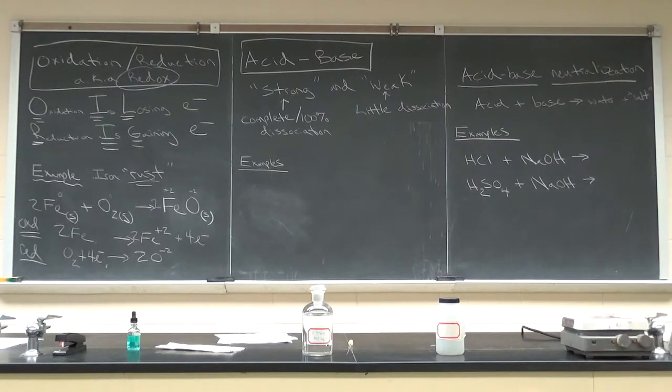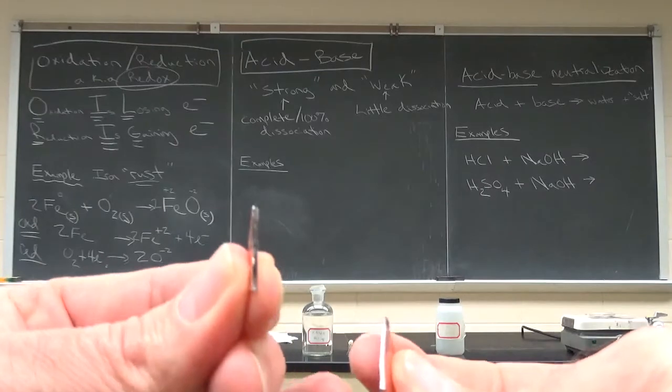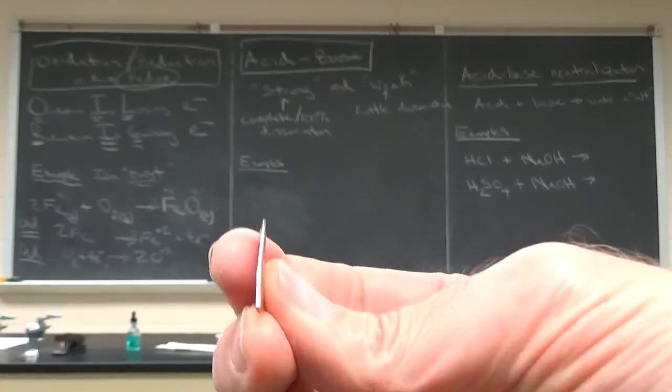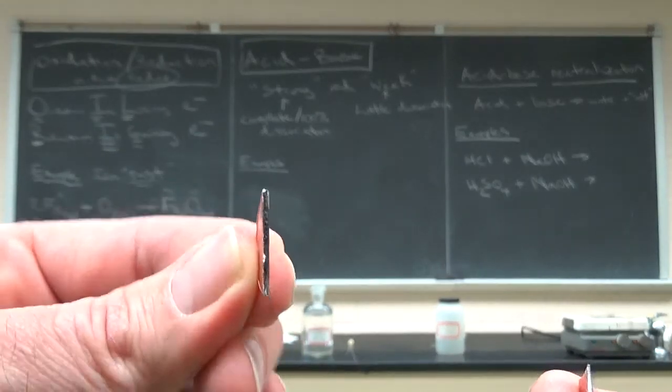It's hard to do this with my goggles on. Okay, so here's the after. So here's the one I reacted. I dripped the copper sulfate on it. It kind of made it dark. And this is just the other half that I didn't do anything to. So something reacted here. It's not just wet, and I didn't burn anything, so it's not like I put soot on there. So what actually happened?